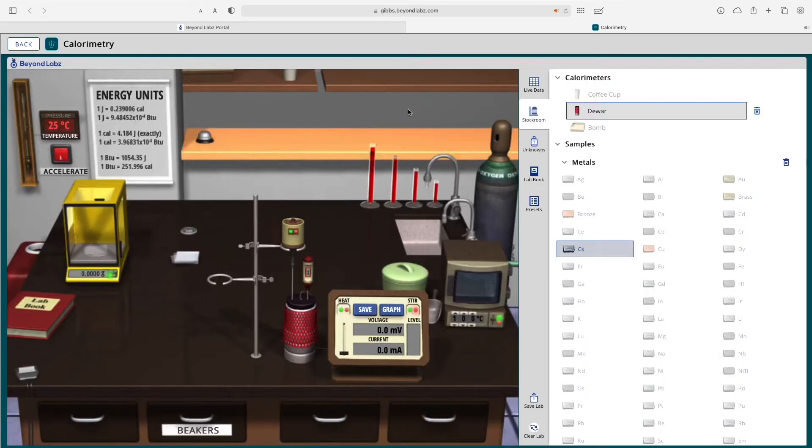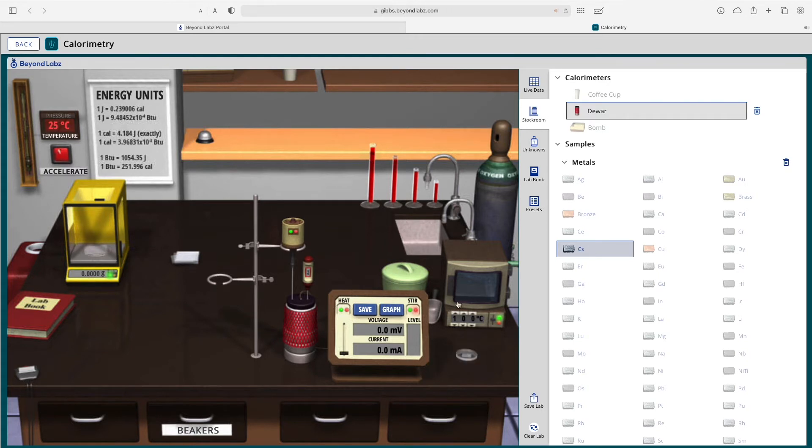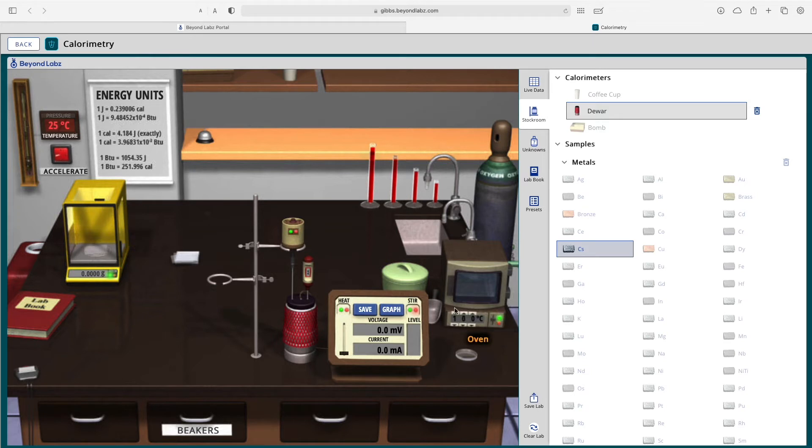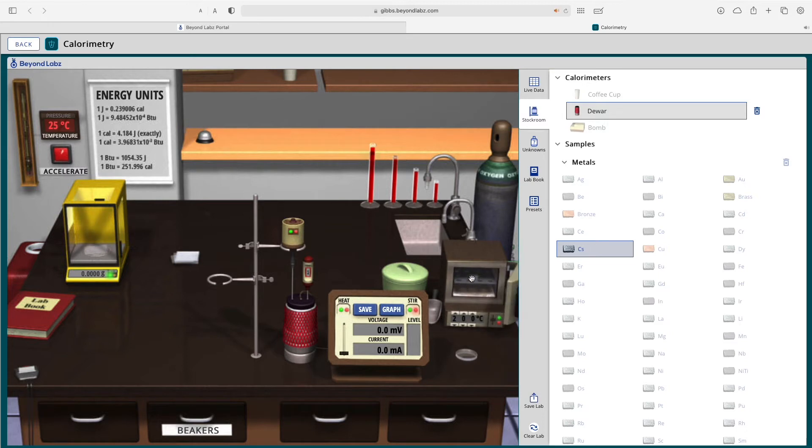And then we can move that cesium over here to the oven if we wanted, stick the cesium in the oven, close the oven, increase the temperature, turn the oven on and off, and then add the cesium to our calorimeter if we wanted to.